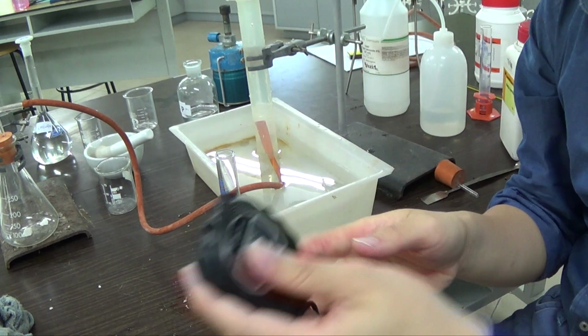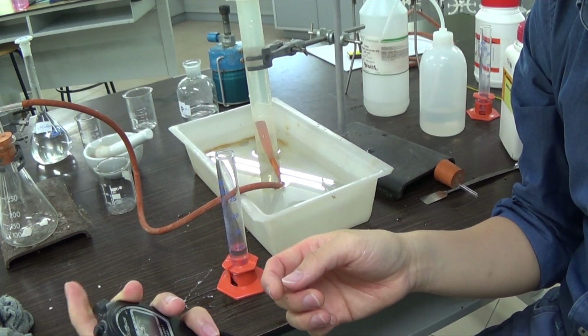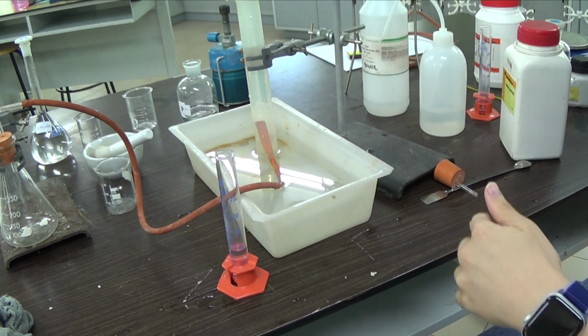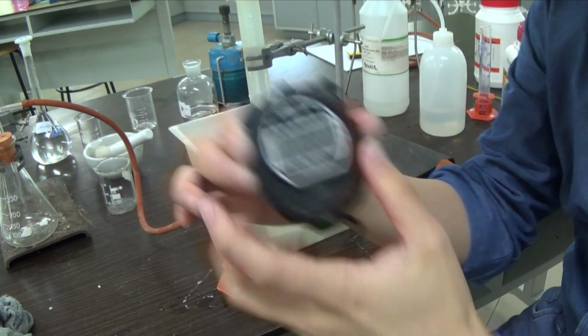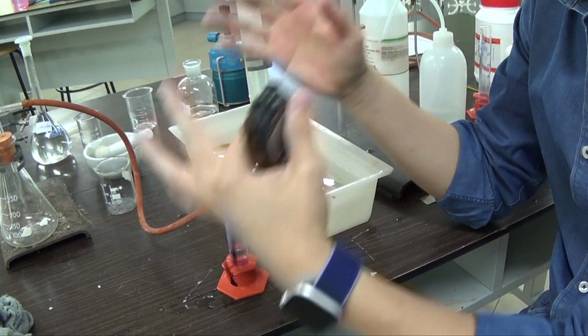Being a rate of reaction experiment, you do need a stopwatch. Let me see if I can get this to work. Can't get that to work. Something is wrong with this stopwatch. This is probably a better stopwatch. This is called a stopwatch. A stopwatch measures time. In a rate of reaction experiment, you want to monitor how much changes over time.